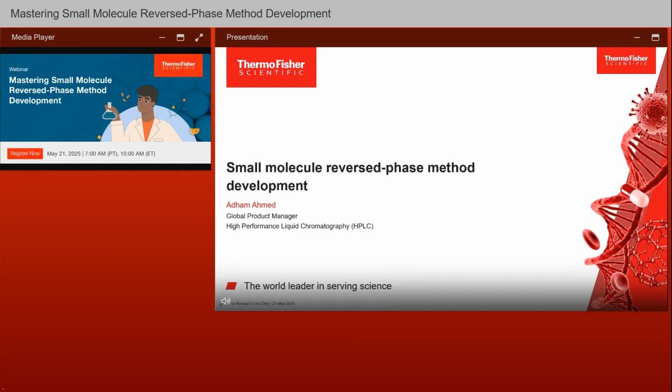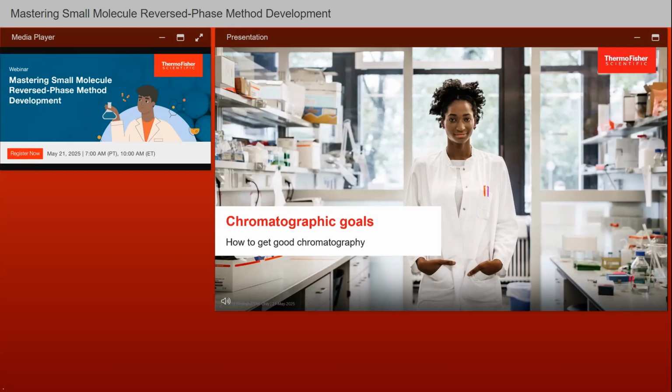Hello everyone, and welcome to today's webinar on small molecule reverse phase method development. I'll be covering various topics to provide you with an overview of the key factors that can impact your chromatography, but also what you need to take into account when you're doing any method development. The first topic I'll be going over is how to get a good chromatography. One of the key goals in chromatography is understanding the factors that have the biggest impact on your chromatography and how to tune that method you're trying to develop.